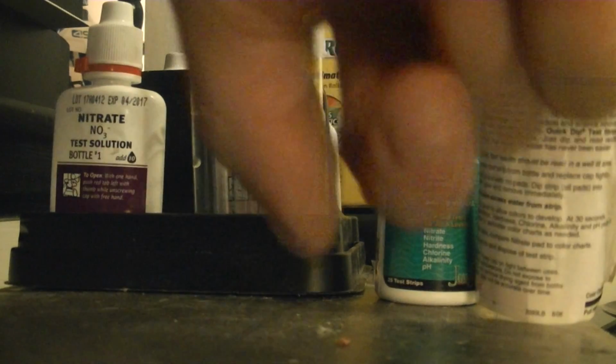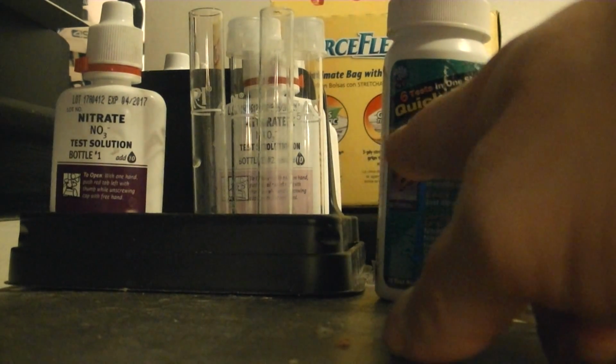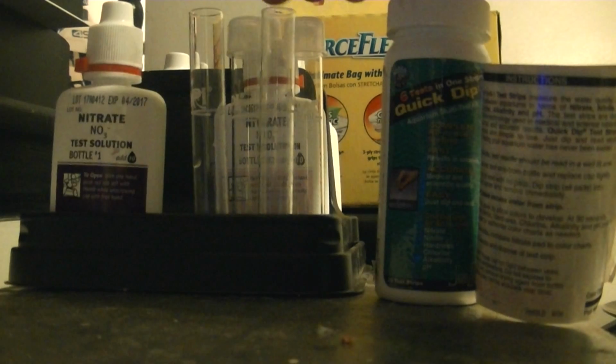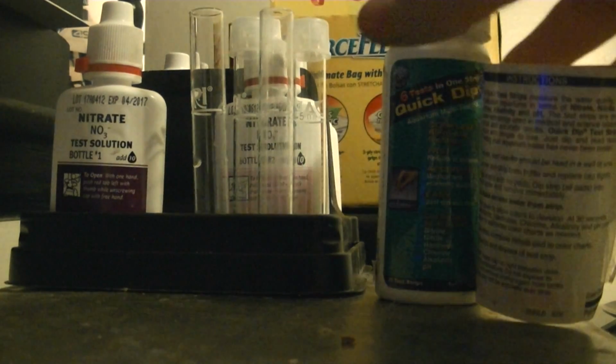So what we're going to go ahead and do here is test nitrates in my tank with both the quick dip test strips and the liquid test we have here. I forget the brand here. Let me see what brand this is. It's an API brand, but they're all pretty much the same if you buy liquid test kits. So what we're going to do here is first test the nitrates with my quick dip. So I'm going to take one out.